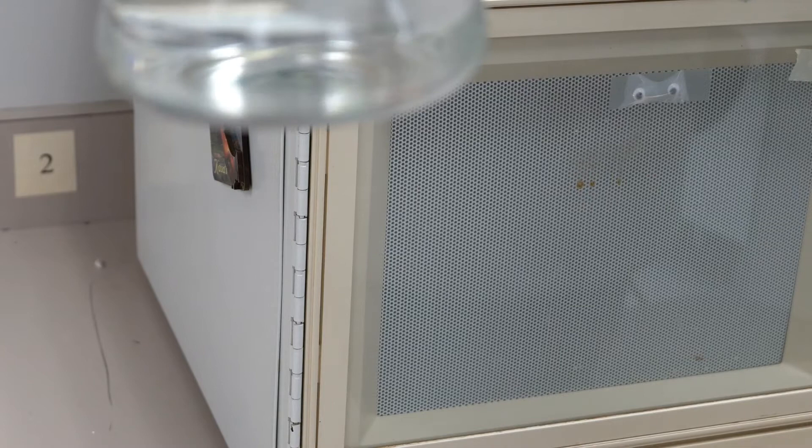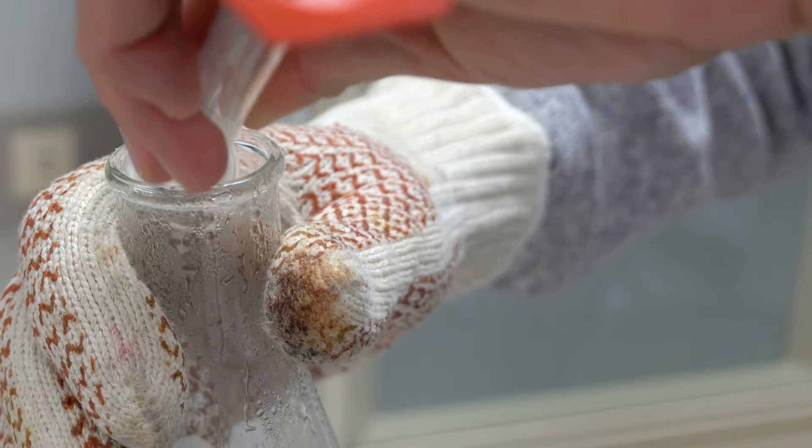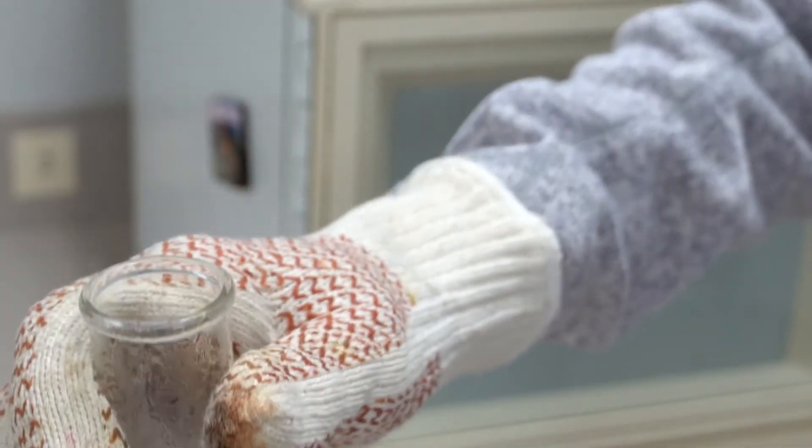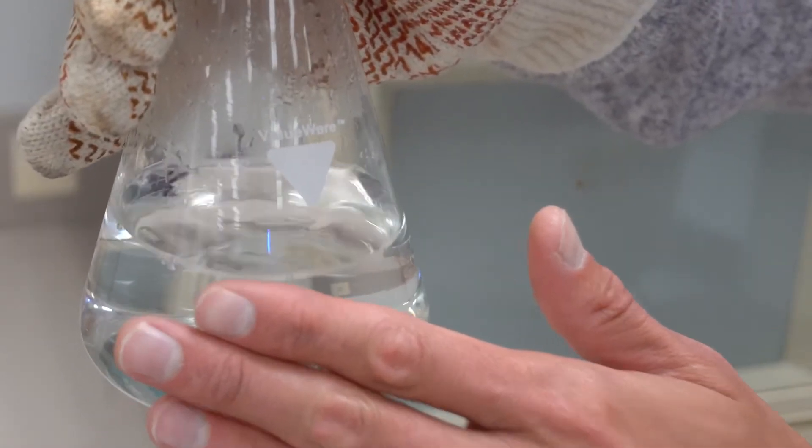The agarose is fully melted now — it looks clear. Very carefully, I'm going to add the phenolphthalein, which is in this graduated cylinder, to the dissolved agarose. I'll give it a little swirl, making sure I don't do this near my face. I'll let it mix up and cool for a couple of minutes before pouring it into a container to solidify.